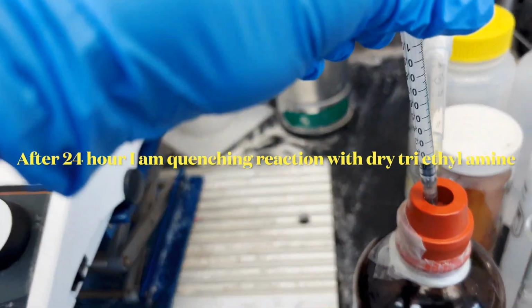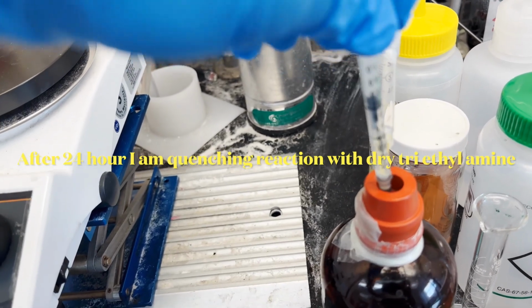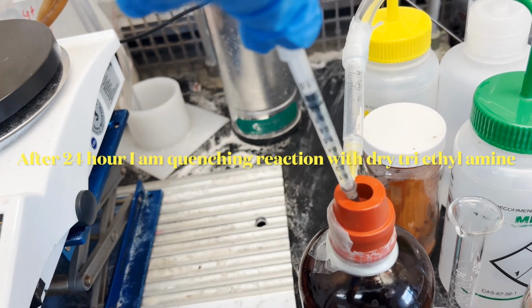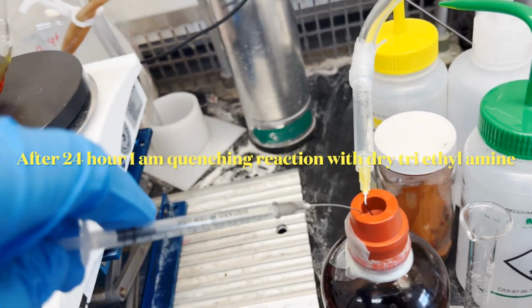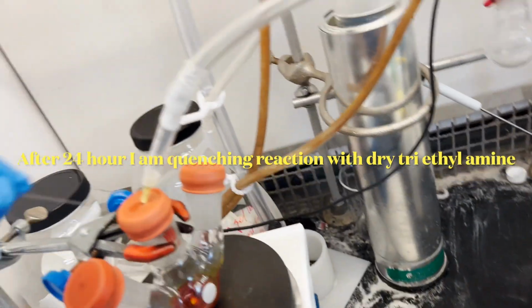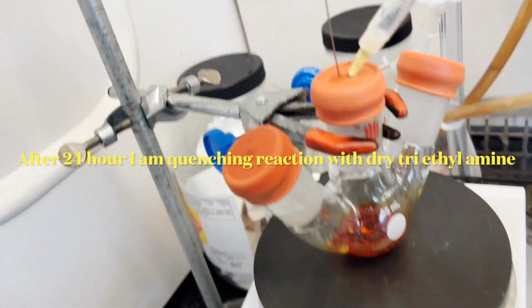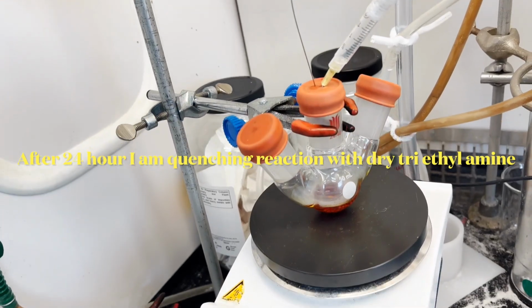Again, these reactions need to be water free. So for any reagent or any solvent you are handling, you must think about the presence of water. Make sure that whatever you are using is anhydrous, with no water. You can make anhydrous solvent and anhydrous reagent, so before setting up the reaction, you should think about it.